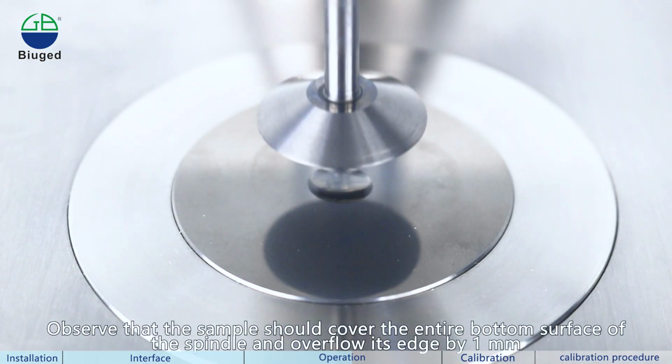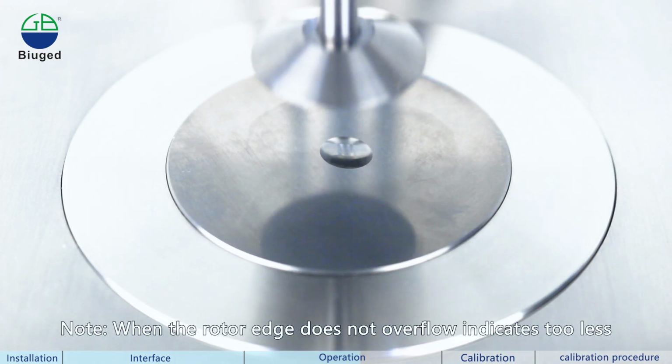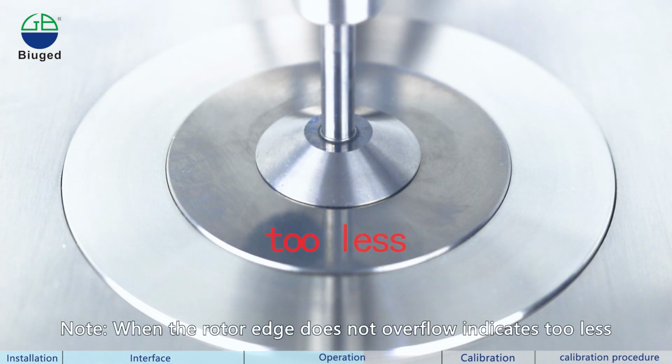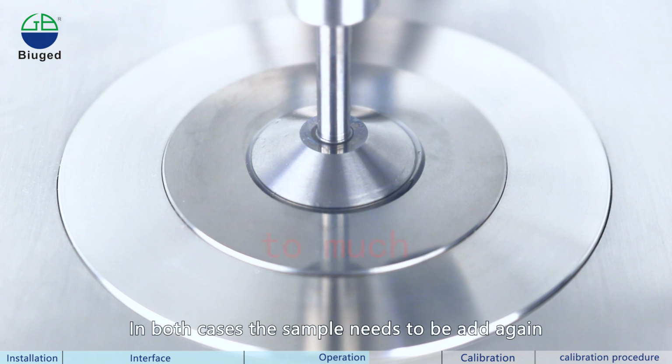Observe that the sample should cover the entire bottom surface of the spindle and overflow its edge by 1 mm. Note, when the rotor edge does not overflow, it indicates too little. Excessive overflow indicates too much. In both cases, the sample needs to be added again.